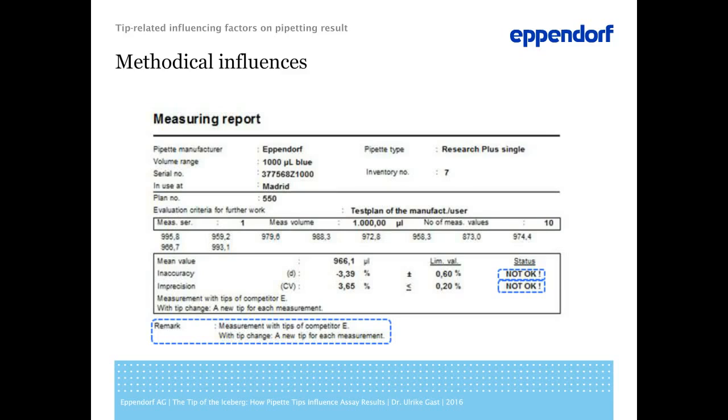So obviously, with this manufacturer, we have to face the facts that the tip change leads to a raised imprecision, which you can see here. So there are tips, like Eppendorf tips, where it does not matter if you perform a tip change or reuse 1 tip within a pipetting series. Just clarify by calibration if there is an influence.